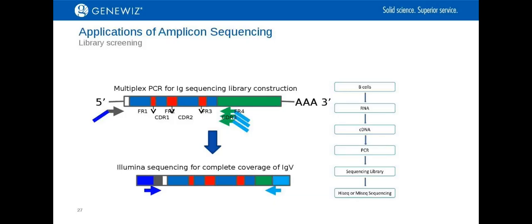Since these genes are relatively small and the complexity of these libraries is very, very large, Illumina sequencing is typically employed. However, there are cases where researchers would want longer reads, such as alternative splicing. PacBio has recently released an application called IsoSeq, which uses an adapted library prep version to sequence long pieces of cDNA.